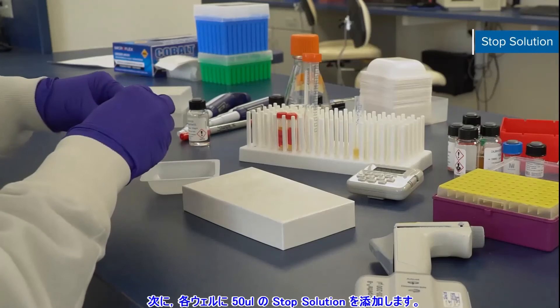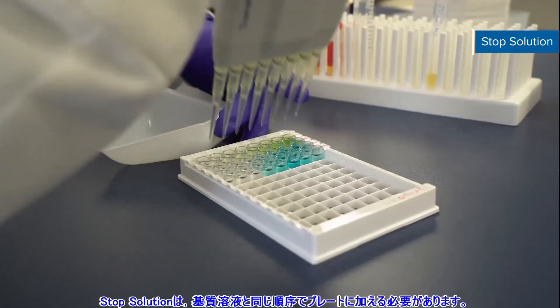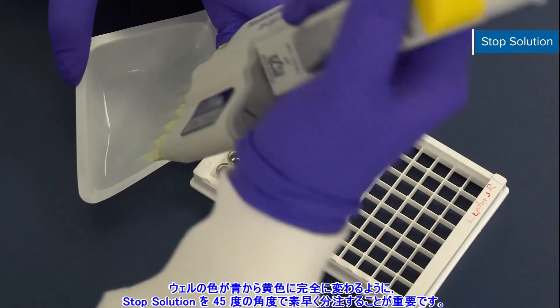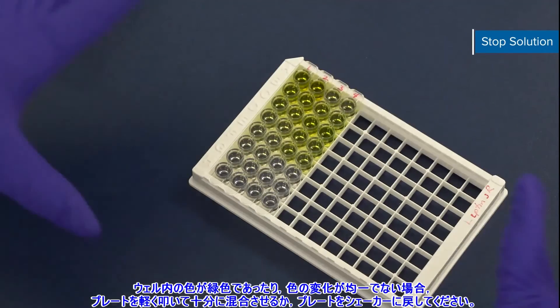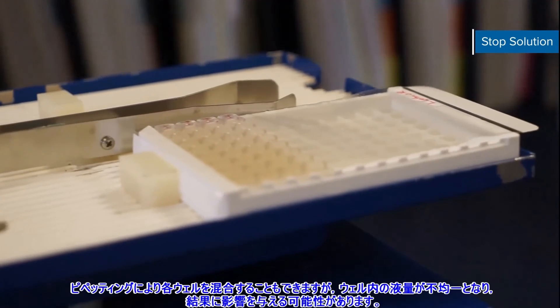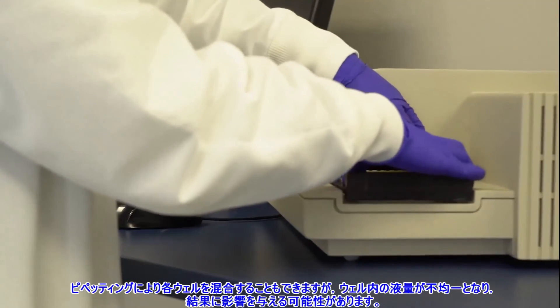Next, add 50 microliters of stop solution to each well. Stop solution should be added to the plate in the same order as the substrate solution. It is important to quickly dispense the stop solution into the well at a 45-degree angle so the color in the wells changes completely from blue to yellow. If the color in the wells is green or the color change does not appear uniform, gently tap the plate to ensure thorough mixing or place the plate back on the shaker. As a last resort, you can use a pipette tip to individually mix each well, but this may result in loss of volume and could impact your results.